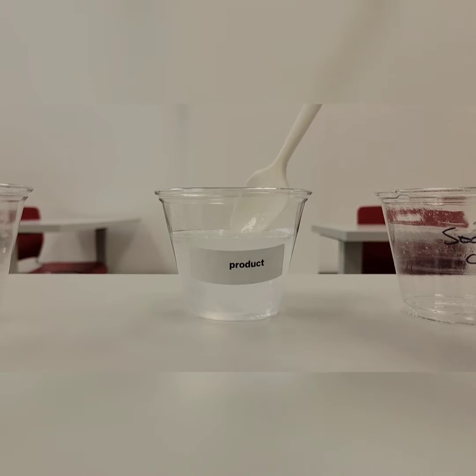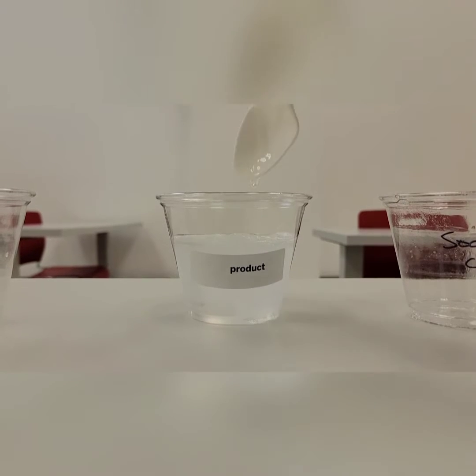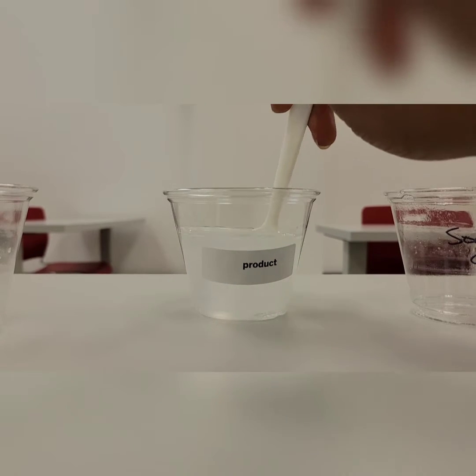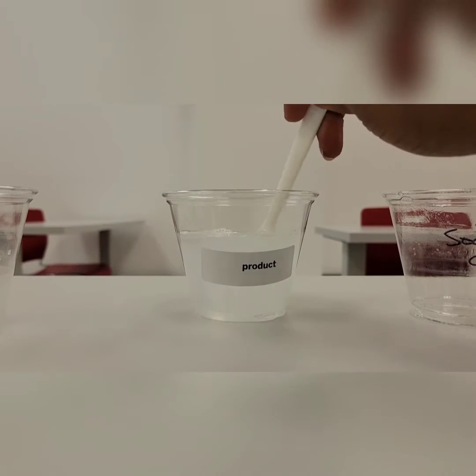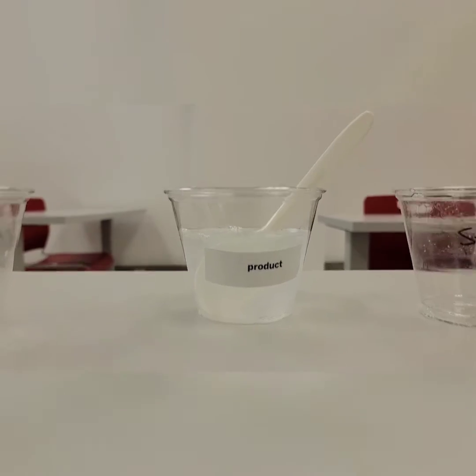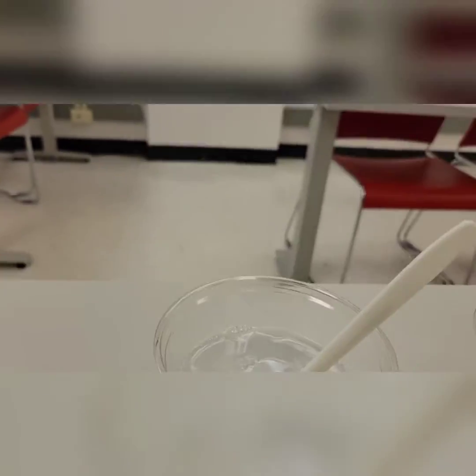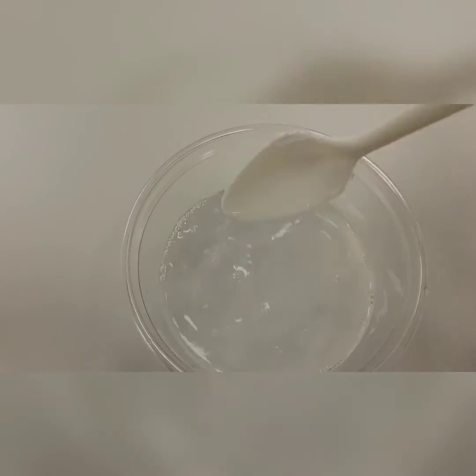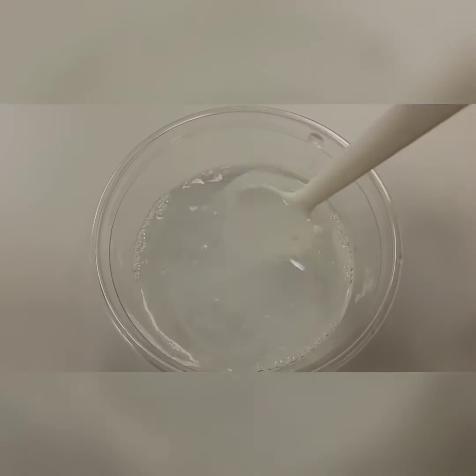My liquid actually is thicker, so I am going to stir so I can mix. And you guys can see the change in color. I'm going to view from the top so you can also see the change in consistency.